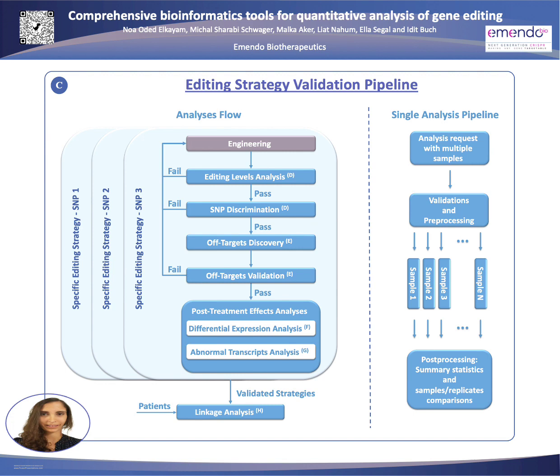Then we move to validate we didn't cleave other genomic regions, called off-targets, by discovery and validation assays. Next, we test our post-treatment effect, analyzing transcripts and expression levels. After passing all strategy validations, we have another assay which fits for each patient its appropriate editing strategy.